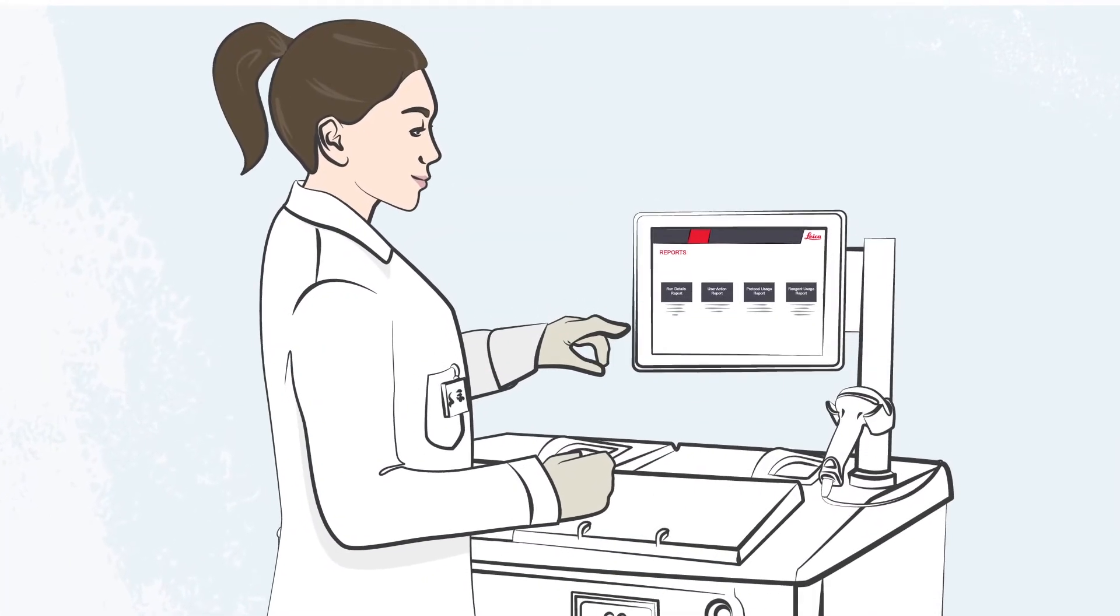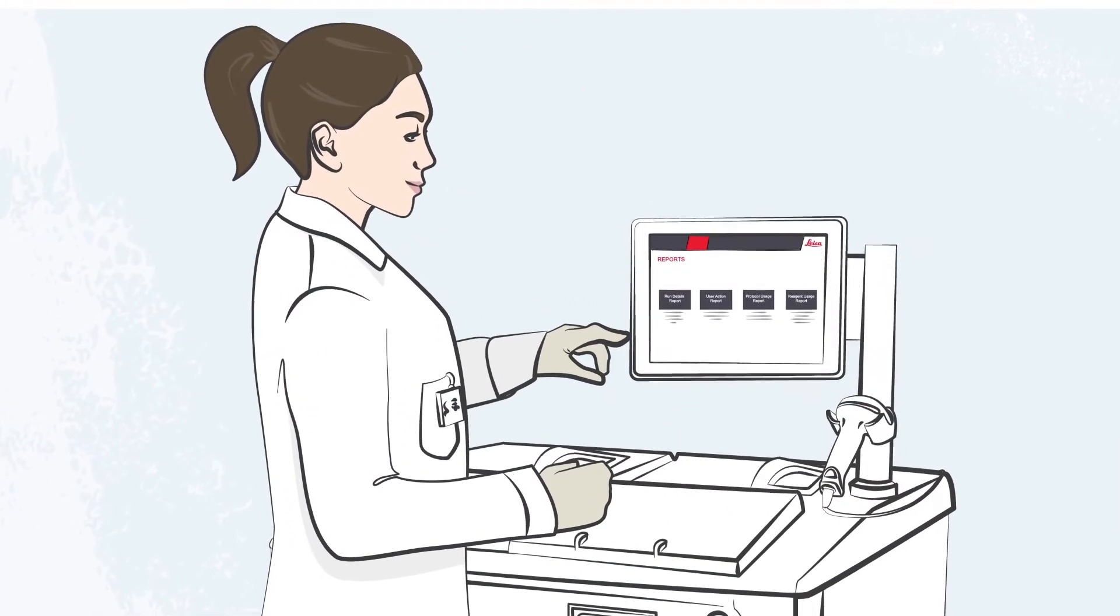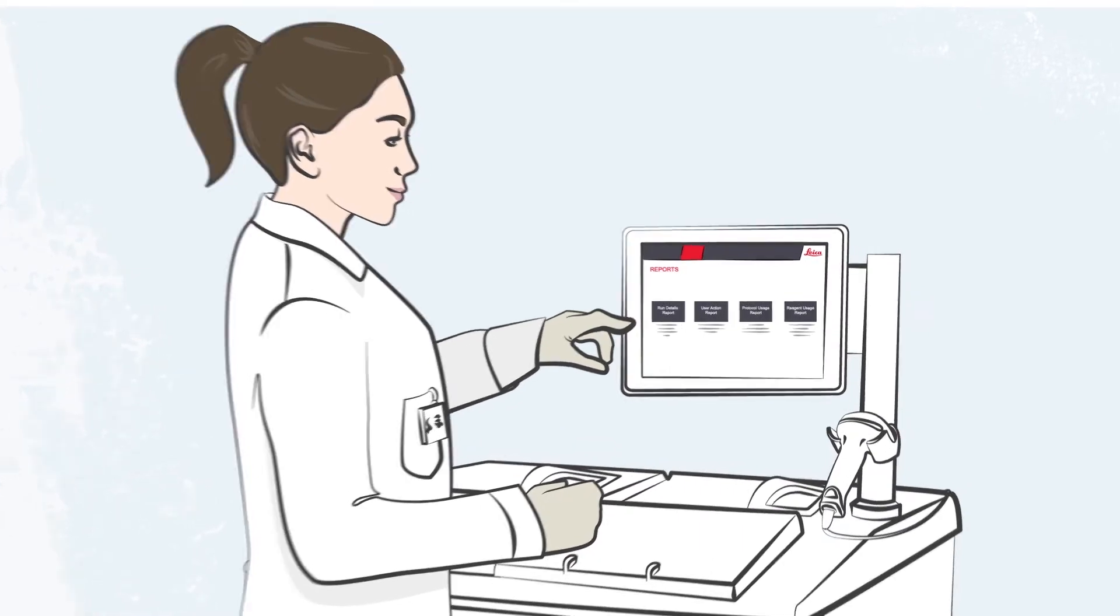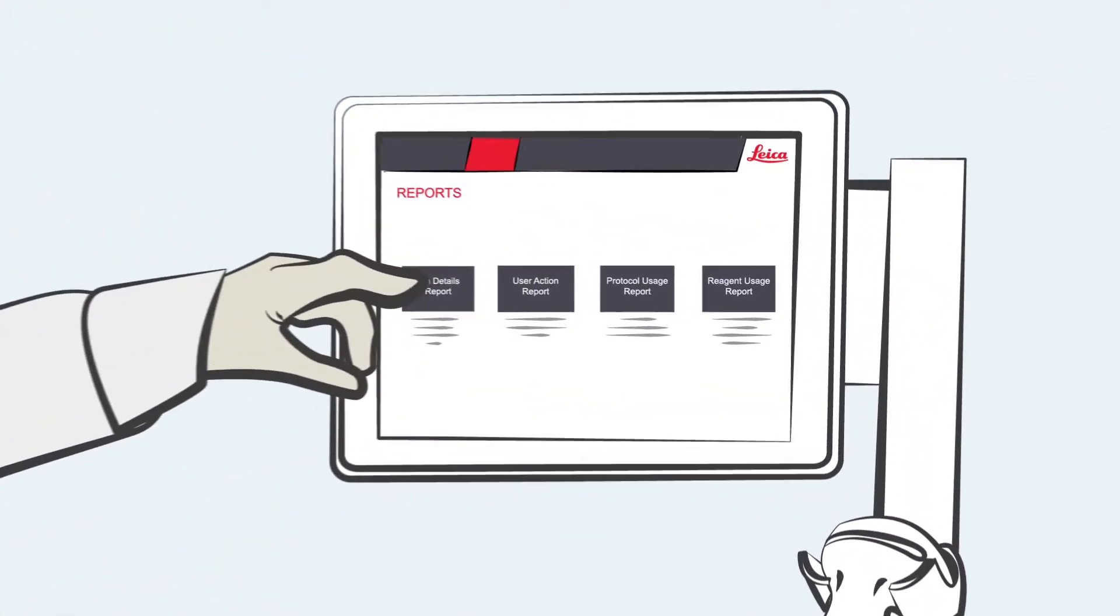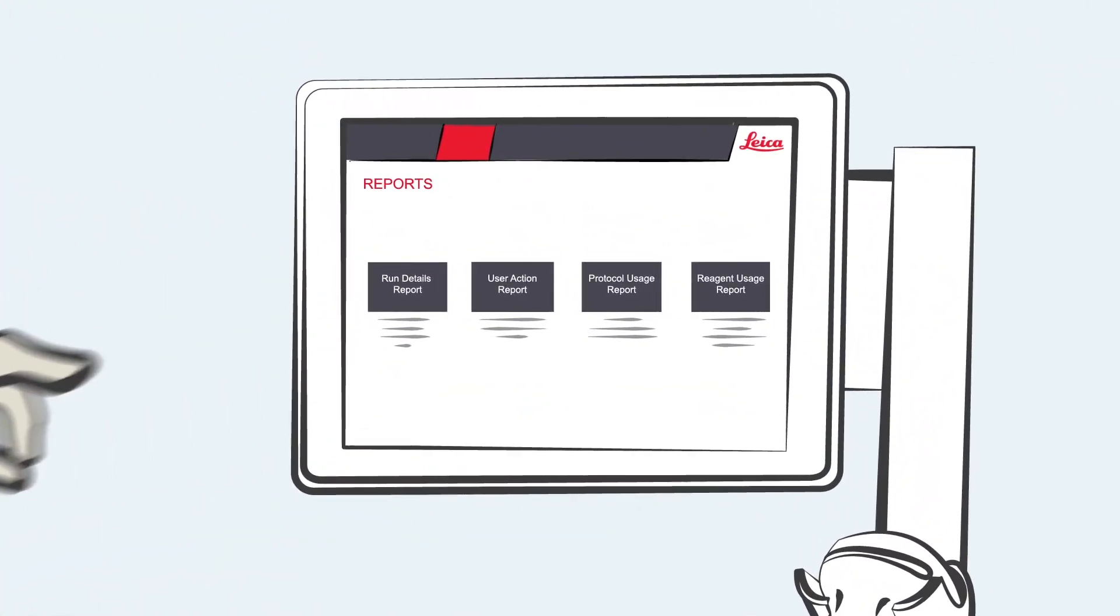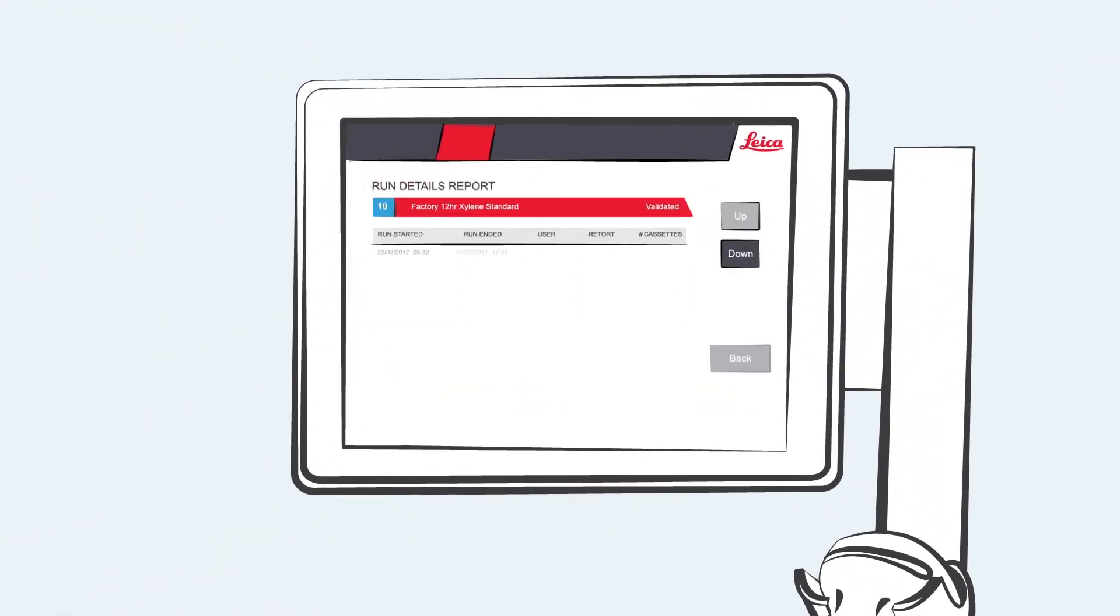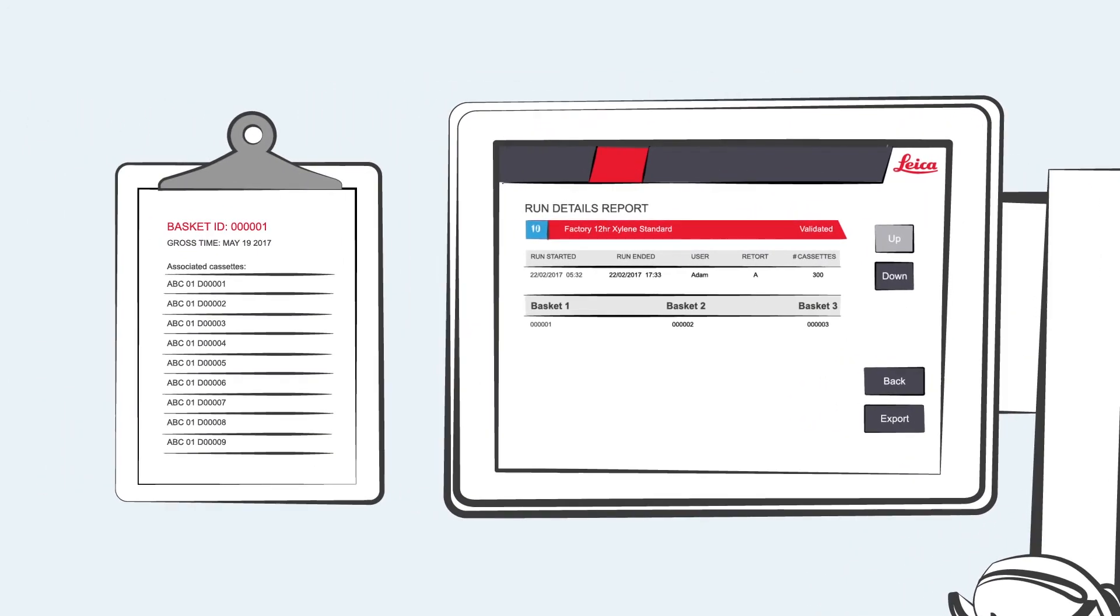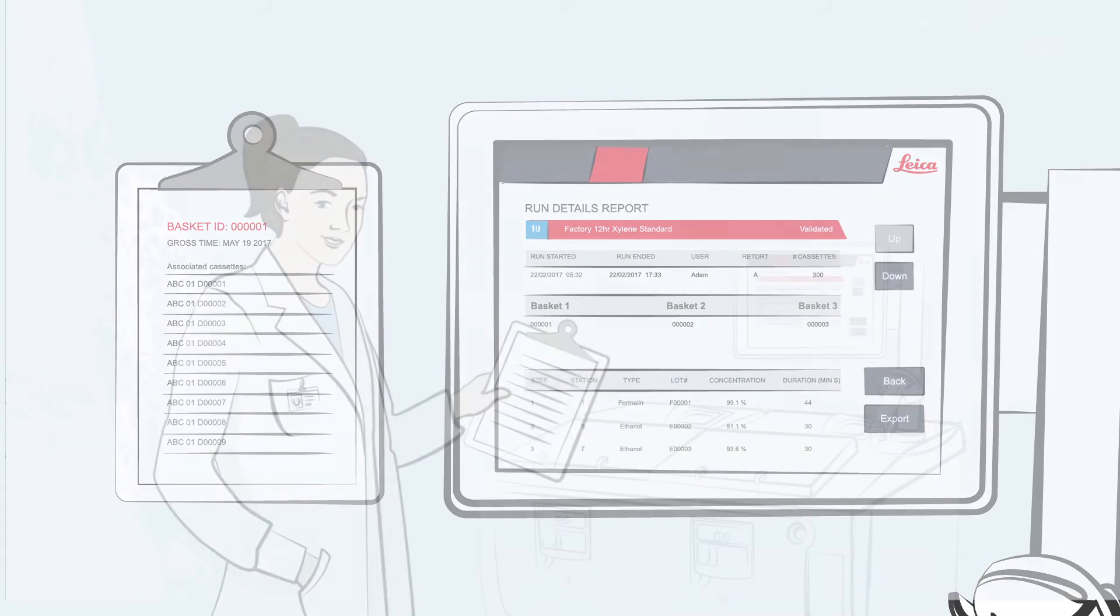The onboard track and trace reporting module of the Polaris 3 easily delivers runtime and summary reports. Jenny has the ability to look up the cassette ID, basket ID, user ID, reagent ID, and the time of grossing associated with the unsatisfactory slides.